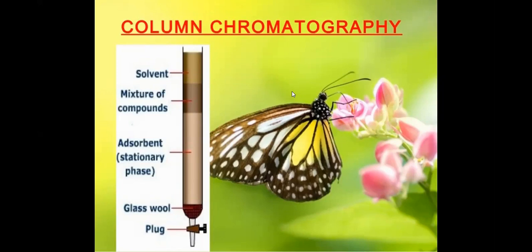As you are observing in the slide, in column chromatography, the requirements are, we need a glass column.